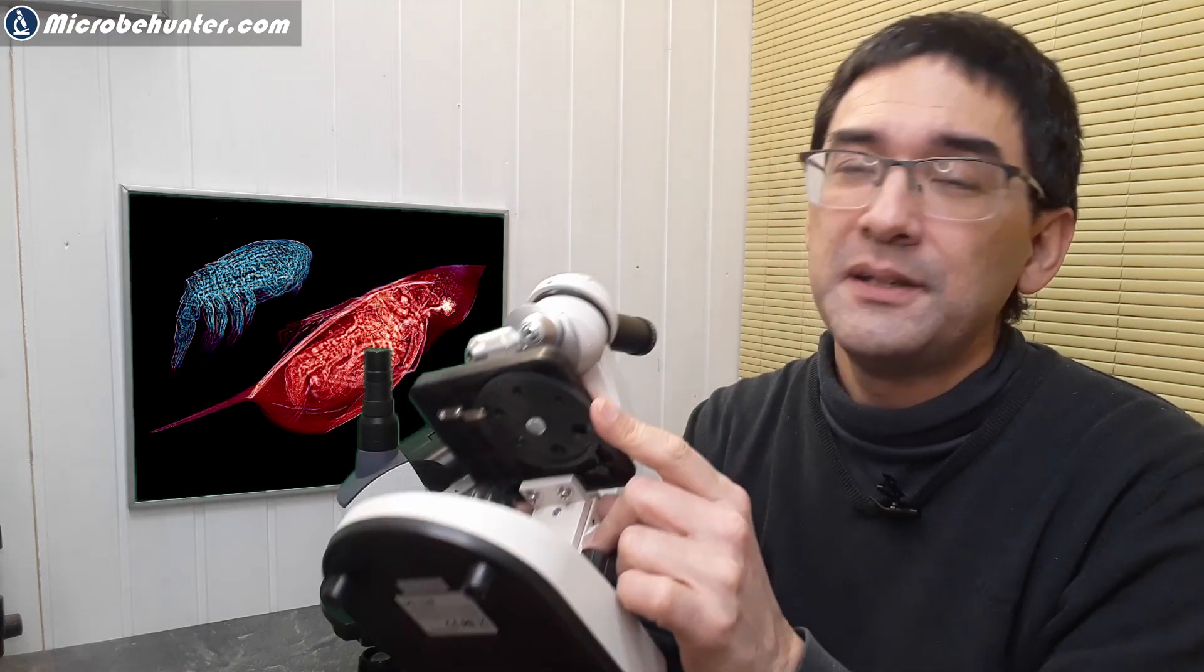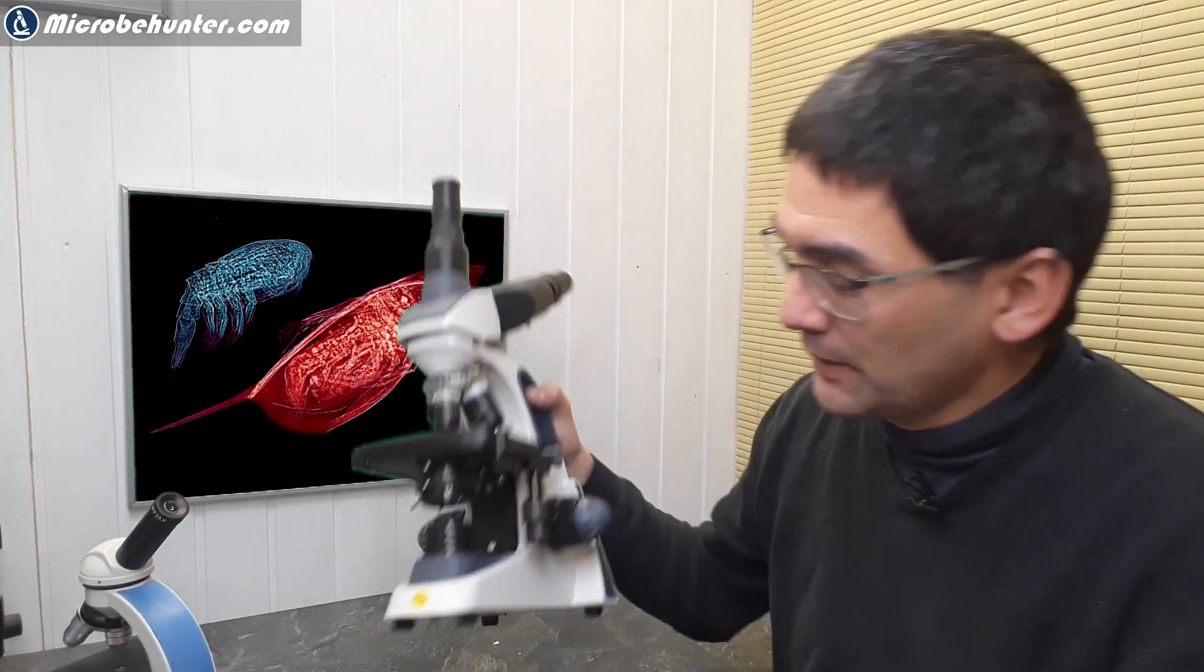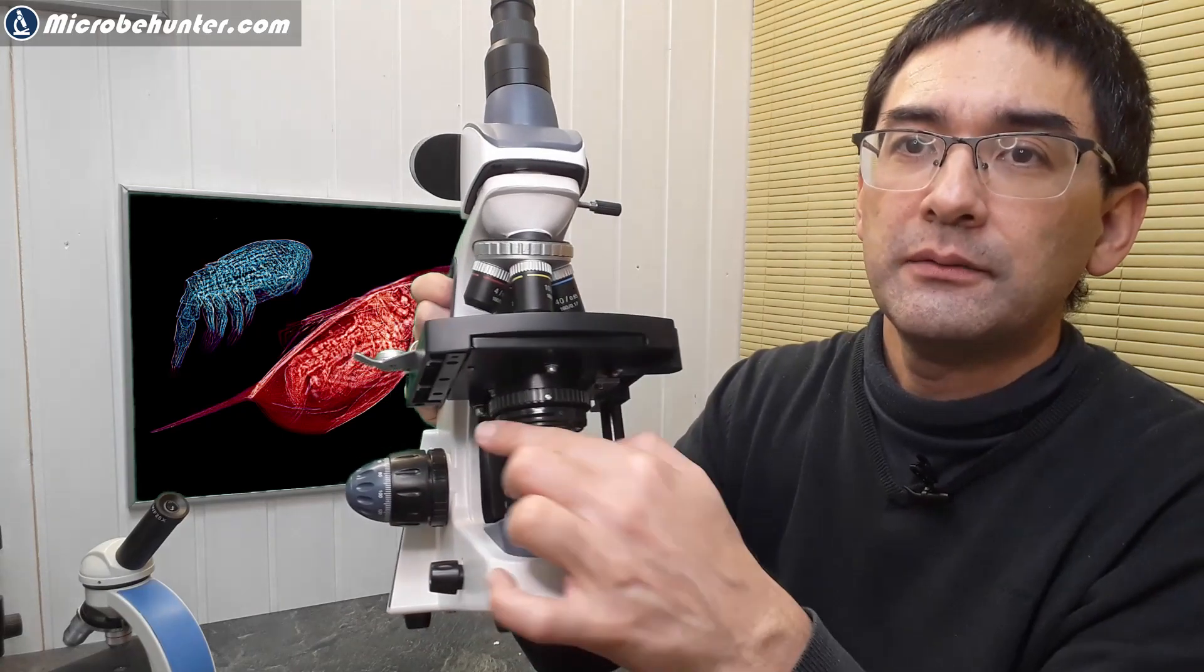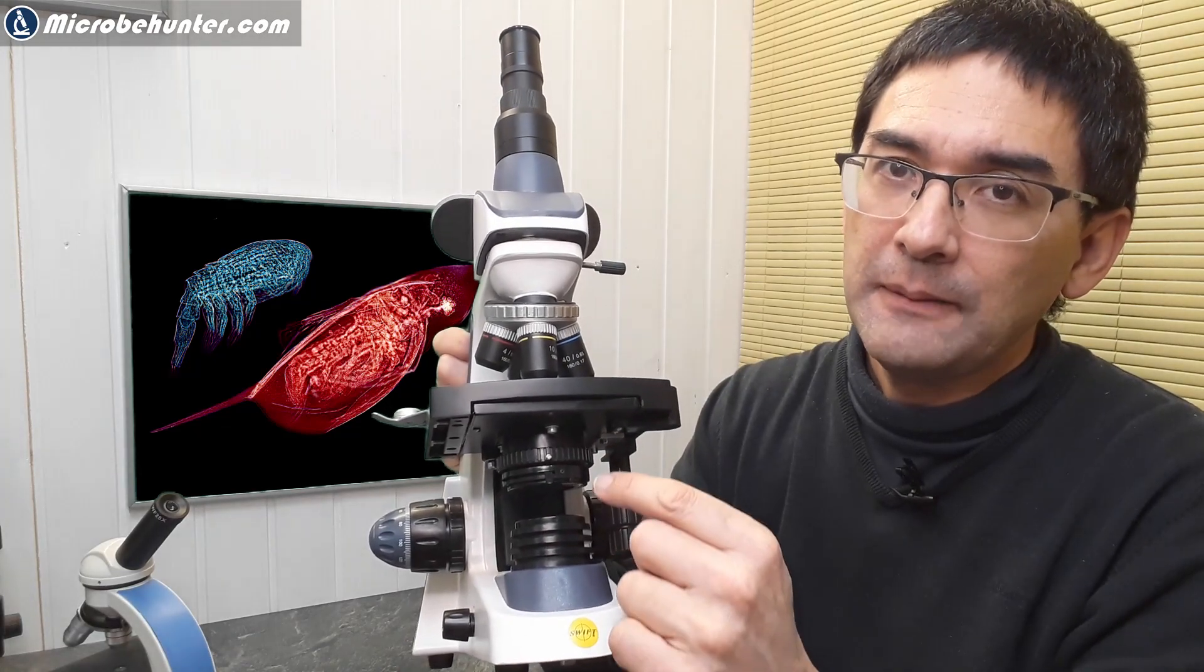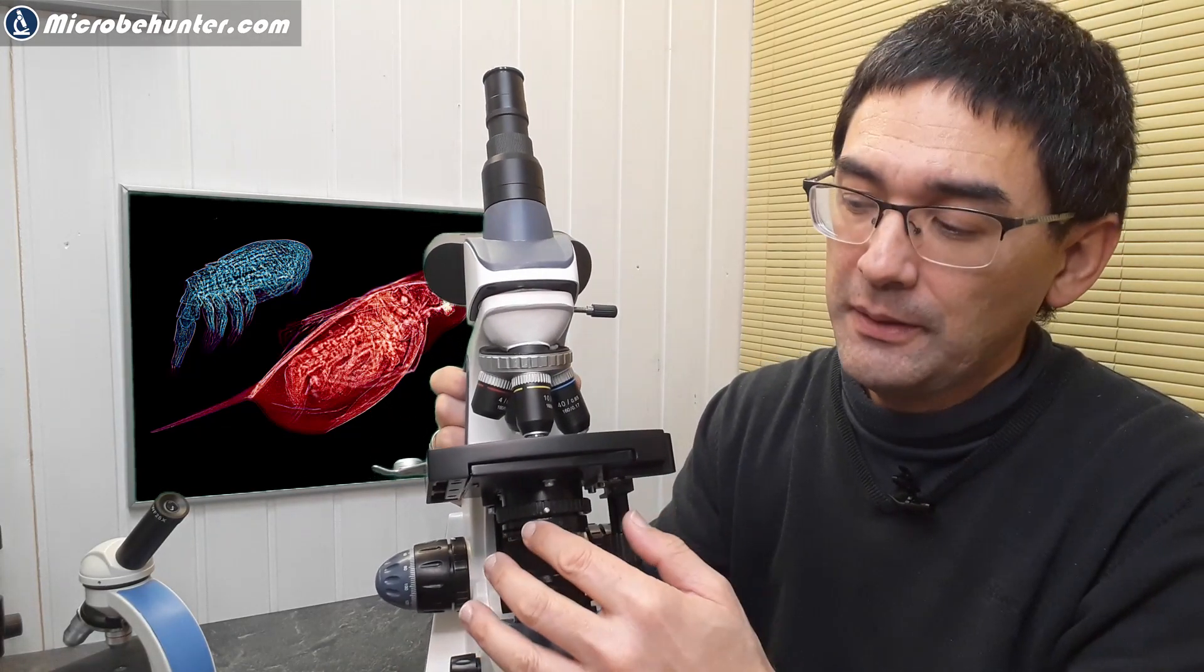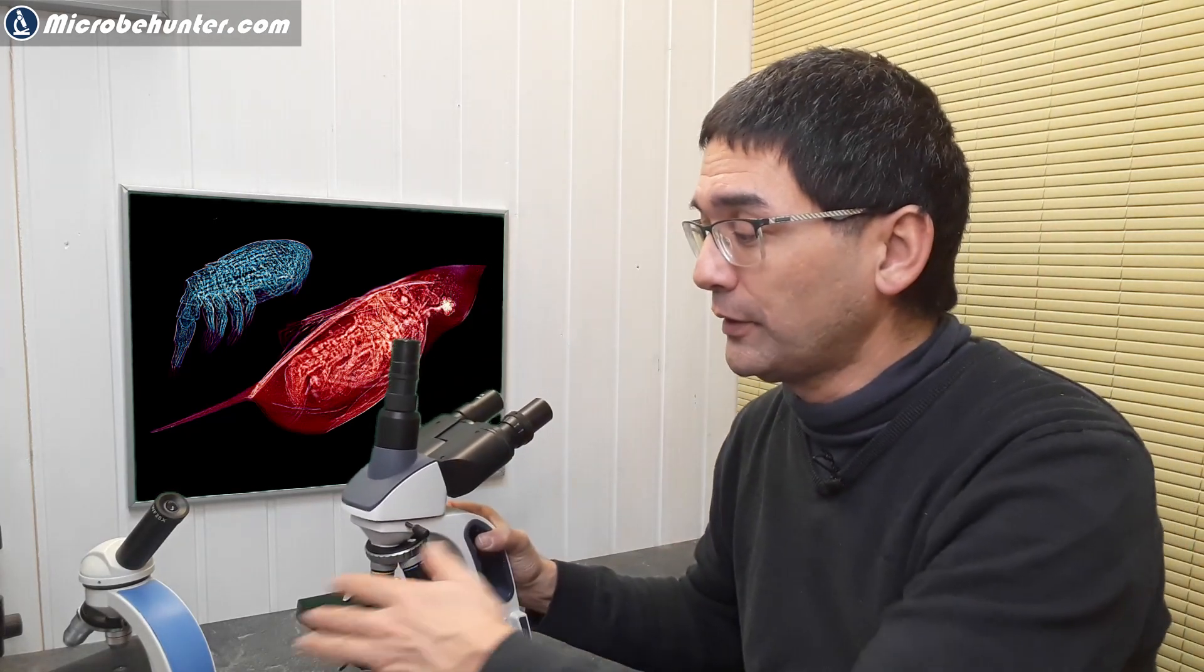And then the question, the second thing is, what about the condenser? Because those introductory microscopes, what they have is they have a rotating disc here, but this is not really a condenser. And I think that the little filters and the holes and apertures that you have in here are pretty ineffective. So I have to admit, I don't really know why the company actually included those because the effect is not really very strong. While those larger microscopes, they have a real condenser and this condenser has of course also, the diaphragm can be open and closed.